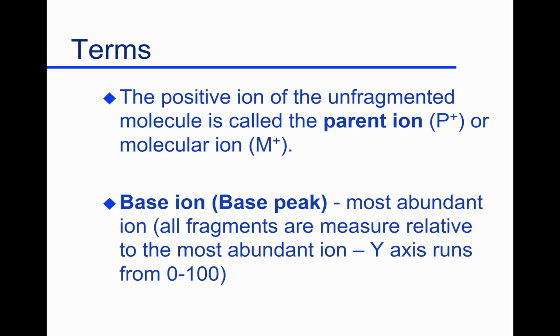Our other ion that we talk about and look for is our base peak or our base ion. Same thing. It's the most abundant ion. What's the most abundant fragment that this molecule breaks into? And that's also very, very helpful in terms of identification. So we look at the overall pattern, but some real keys that we like to see: What's the molecular weight? What's the most stable fragment, the one that's present in the largest quantity?